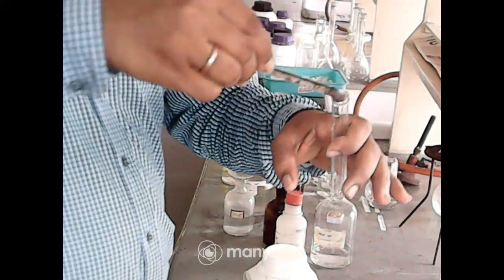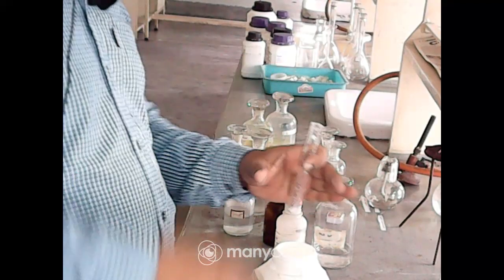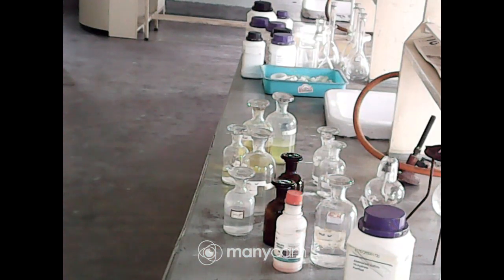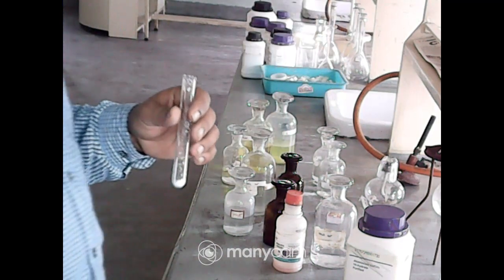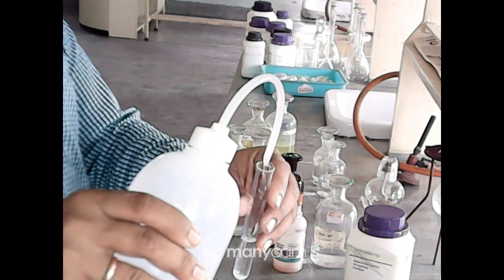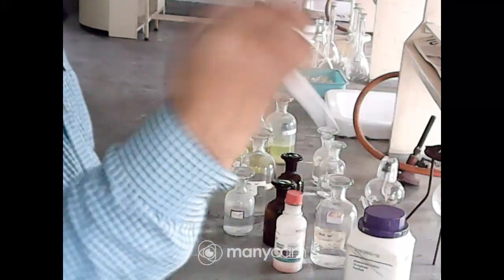Take the sample in the test tube. You can see this is the solid sample taken. Now add water to make it a solution. This is the first work for you. Take the solid sample which is supplied. Now shake it well to dissolve it.